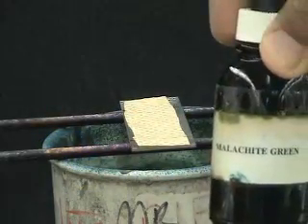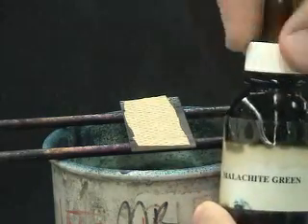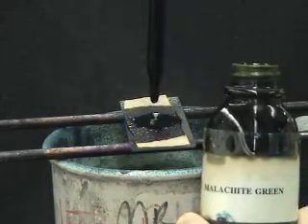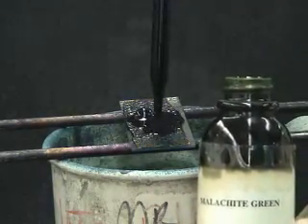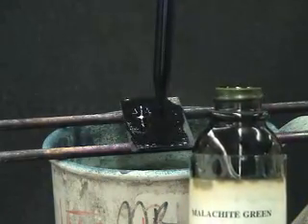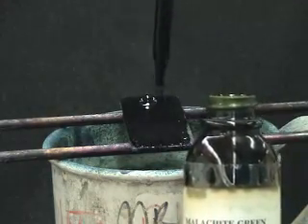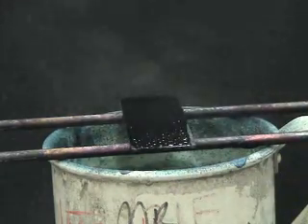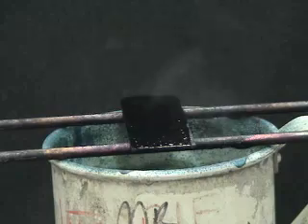Once the water bath is boiling, a large amount of malachite green is added to the slide, and the slide is stained for five minutes. It is important to watch the slide carefully during the staining to prevent the malachite green from completely evaporating and ruining the slide. As shown here, it is often necessary to add extra stain during the five-minute boiling period.